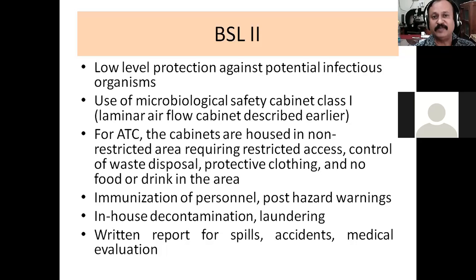Even laundering, for example: if you are wearing an apron, then after its use it should be autoclaved, sterilized, and then laundered. Ironing, for example, should also be done within the facility itself. The material doesn't go out of that biosafety level.